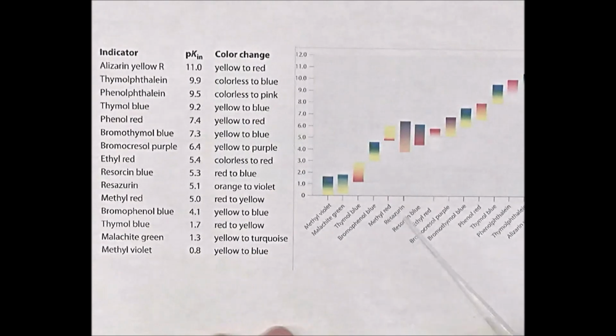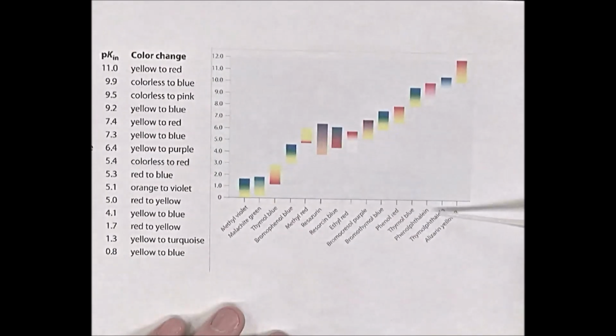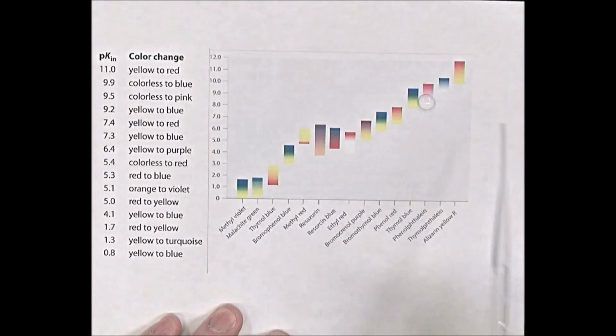All right, let's take a look at another one. Over here we have phenolphthalein, a common acid-base indicator in high school chemistry. Going up to the color smudge, it looks white down here, which means it would be colorless at low pHs. And then above it, it's pink, so at high pHs, it will turn pink. And it's changing color, oops, I just put a drop of water on my paper.